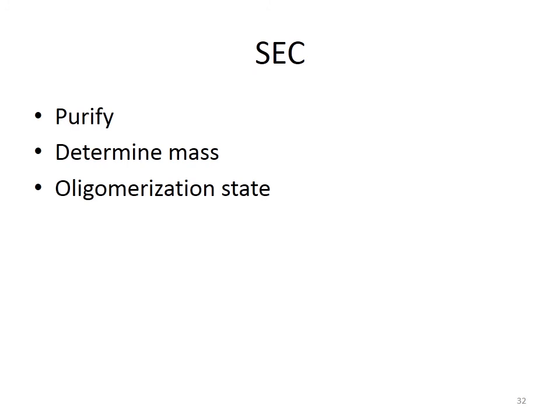So we can carry out chromatography under the native conditions when the protein is in its original structure, and can find the elution volume of that protein, and hence can determine the mass. Then another run of the same protein could be done under conditions which dissociate the subunits from one another.